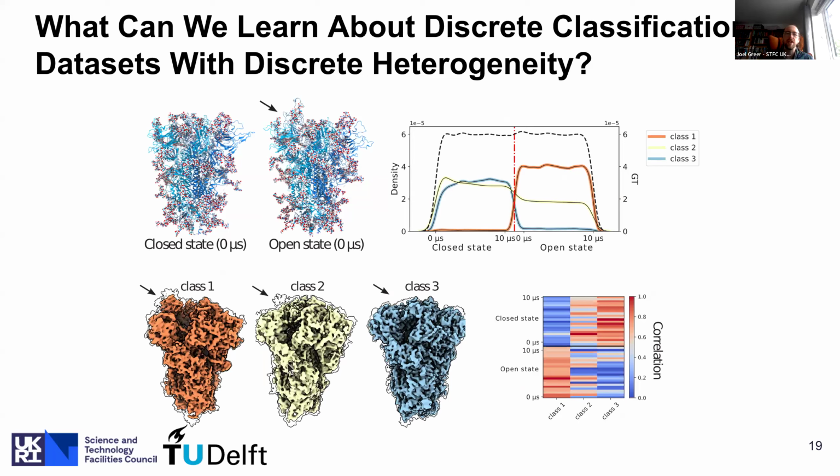Here we show the actual refined density maps for each of those 3 classes. We've thresholded them all at the same contour level, so that's what these colored isosurfaces are. But we've also determined isosurfaces using a statistical technique, i.e. false discovery rate controlled maps. This is where we set the probability of false discovery of the density to 10%. You can see these false discovery rate controlled maps plotted here as these black outlines around the colored isosurfaces.